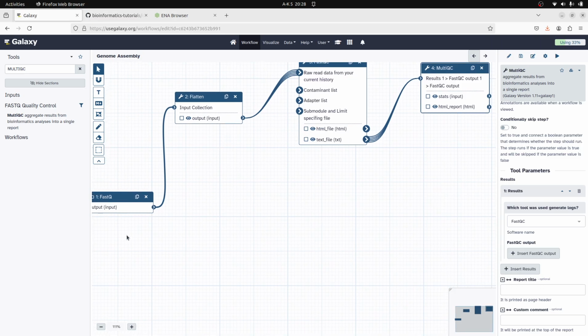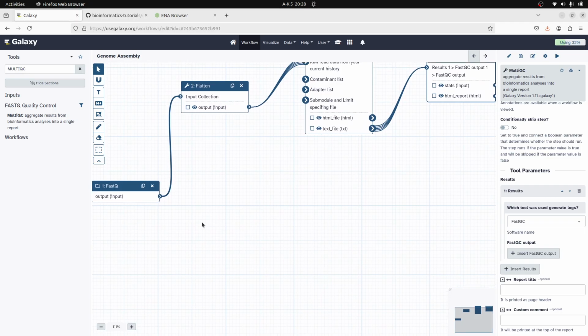Now for the raw reads, we are also going to perform trimming. So here the assumption is that when you do trimming, it's going to improve the reads. Of course, later on you can do your own stuff, but this is what I need to do. And also it's important that before you even do the workflow, you should do some prospecting. That means if you have multiple files or multiple samples, you can just take one or two, run FastQC separately just to see what data it is. And then based on that information, you can use that to do batch processing.